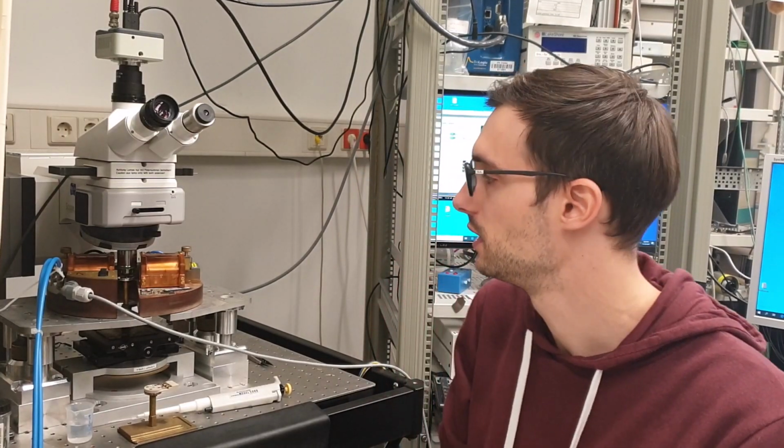So the information depth of Kerr microscopy is around 20 nanometers for metals, but it can be larger for some metal oxides. But in any case, Kerr microscopy is a surface sensitive technique, and the resolution limit is around 250 nanometers, as it is for a standard light microscope.